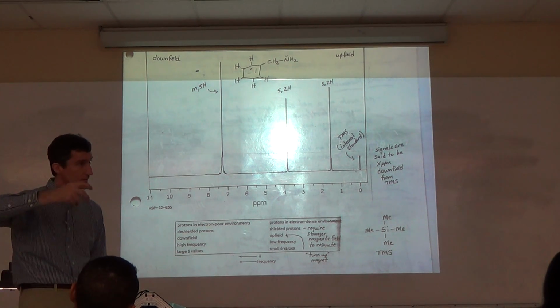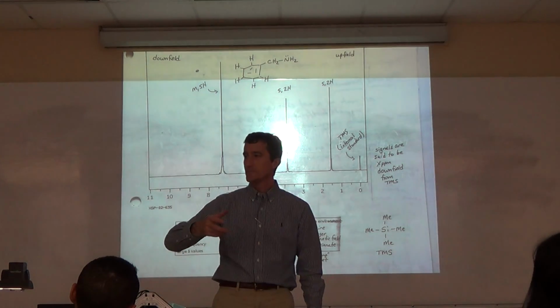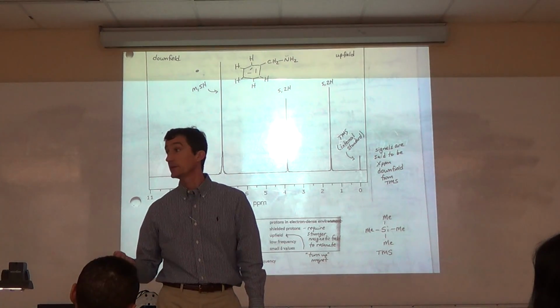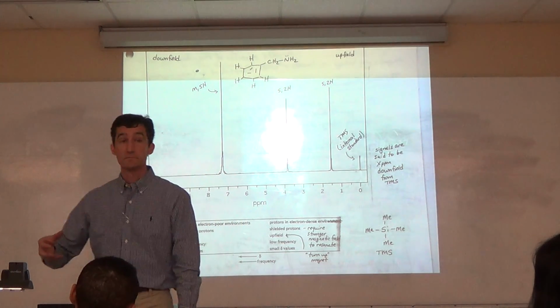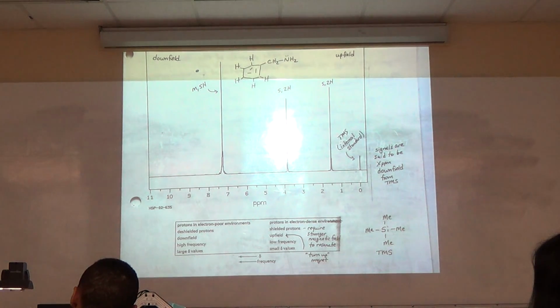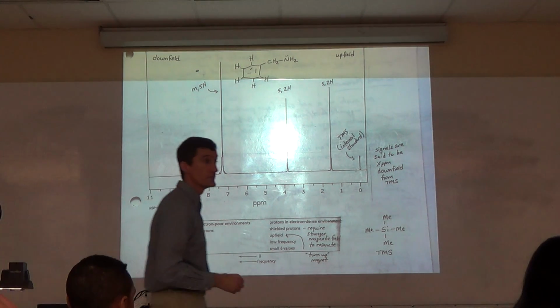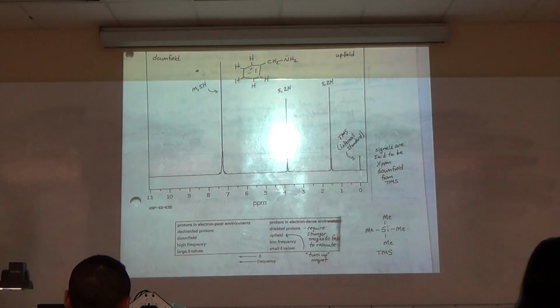Okay, the magnet drifting is analogous to old radios with the little dial you tune in your radio station. It's fuzzy. You guys don't know this. Some of you may. You get it set just right. You get the antenna pulled out. Oh, it's coming in good. You come back the next day and the sound is no longer coming in good. Nobody moved the dial, but what happened? The signal coming from the tower wherever got changed. What do you have to do? You have to tweak it again, which uses the internal magnetic field to do the tweak. You probably know more than me, but it's kind of like that.